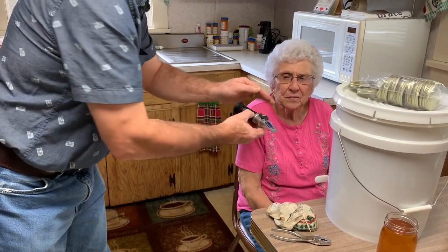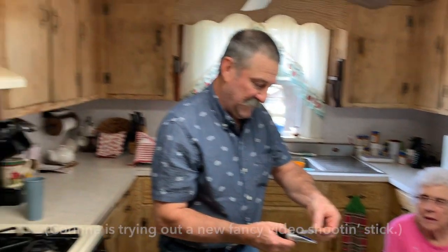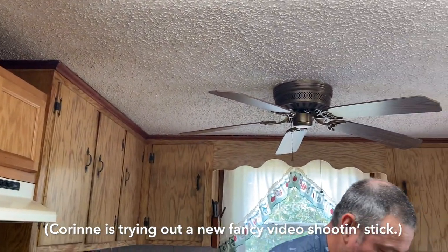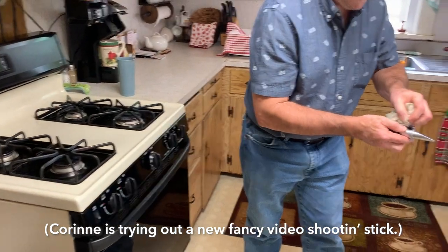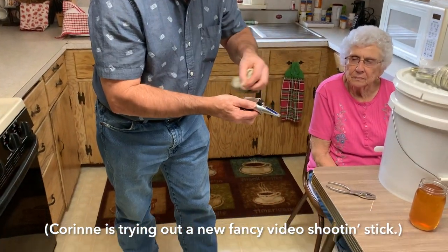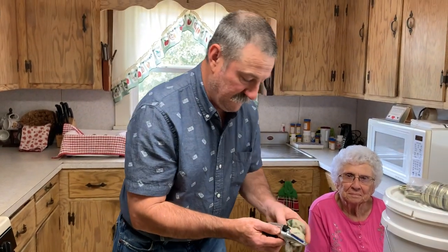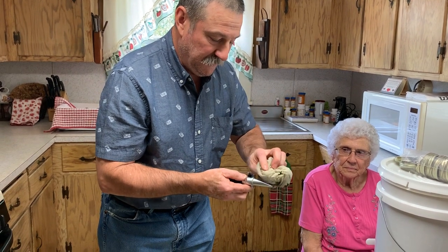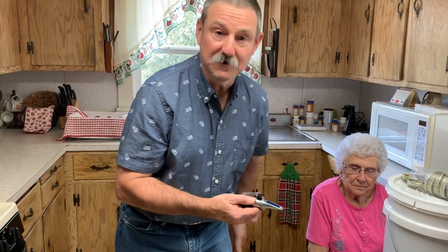So we're perfectly fine. We knew in reality that we had a good, dry enough honey to do this. We didn't run anything that was not capped. This is just an interesting instrument for y'all to know is available if you have questions about your moisture content.